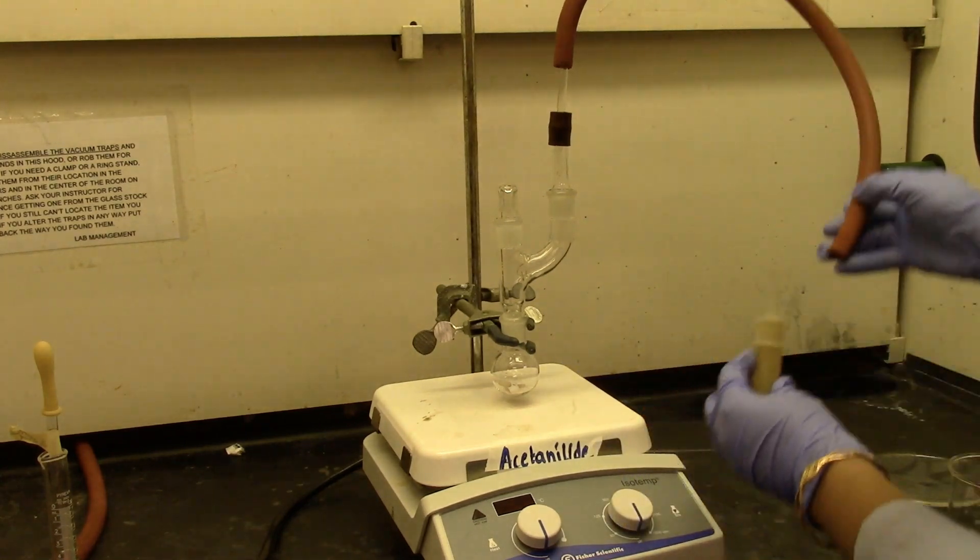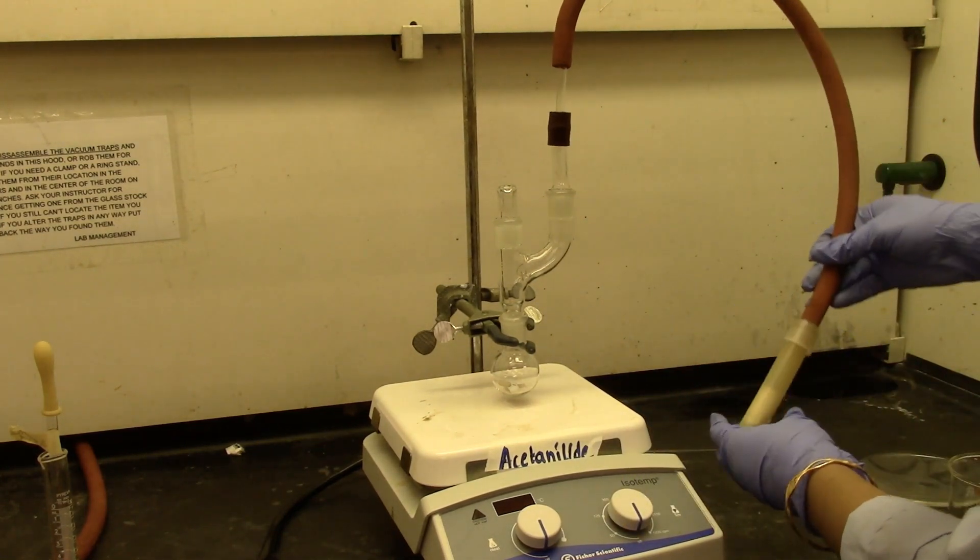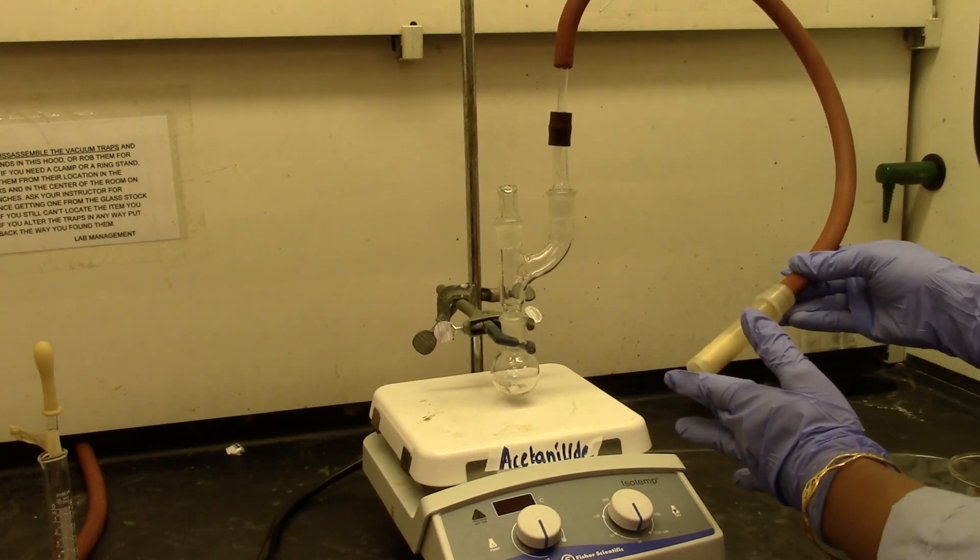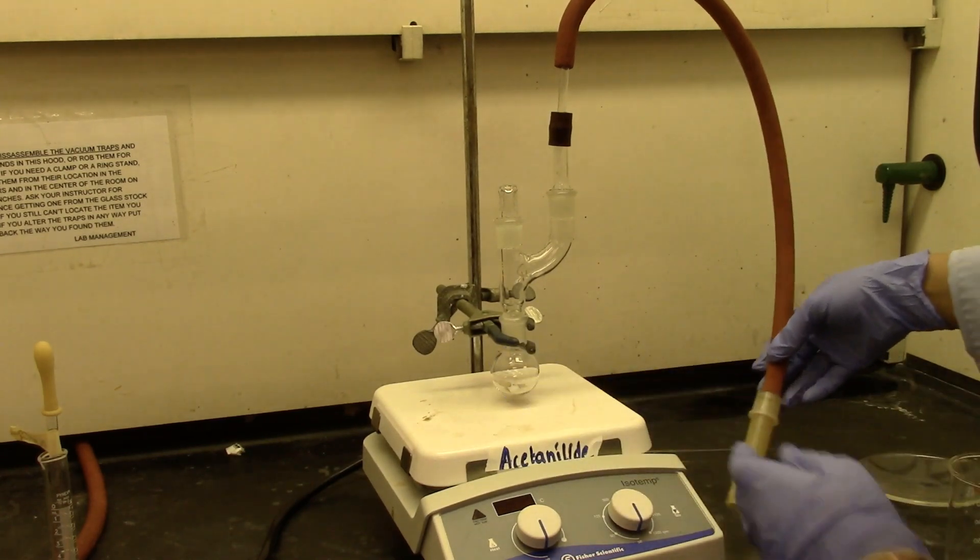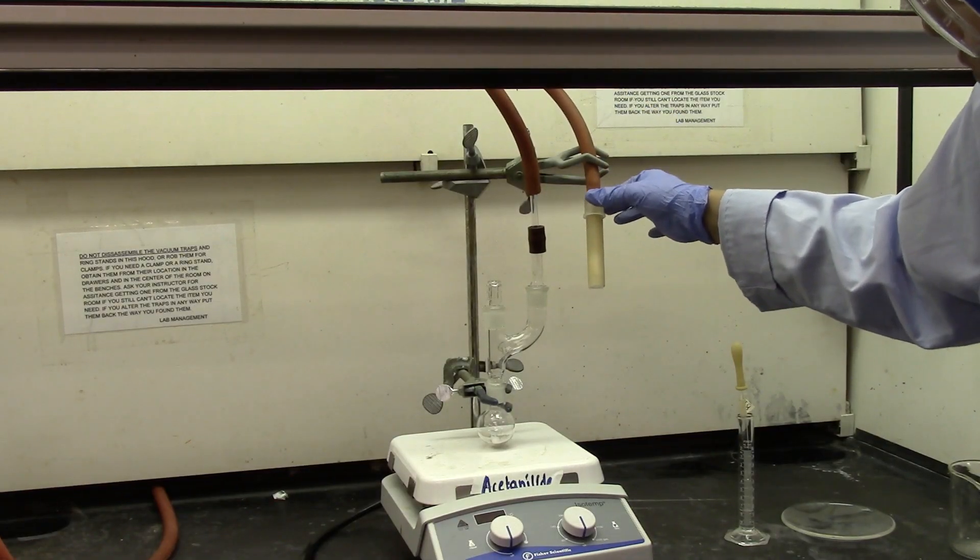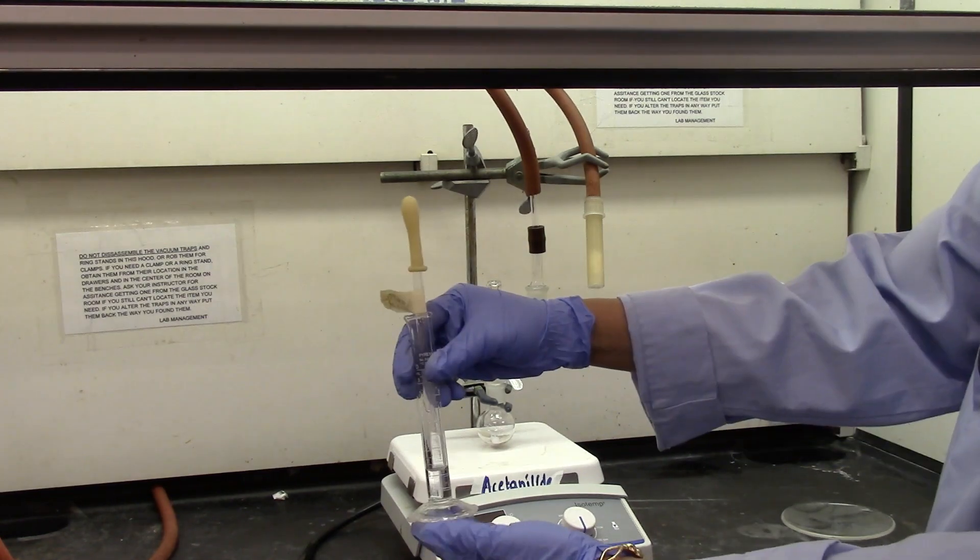And this goes in the drying tube. I'm going to attach it with the tubing right here. This is going to catch any bromine vapors that might be escaping from the solution.